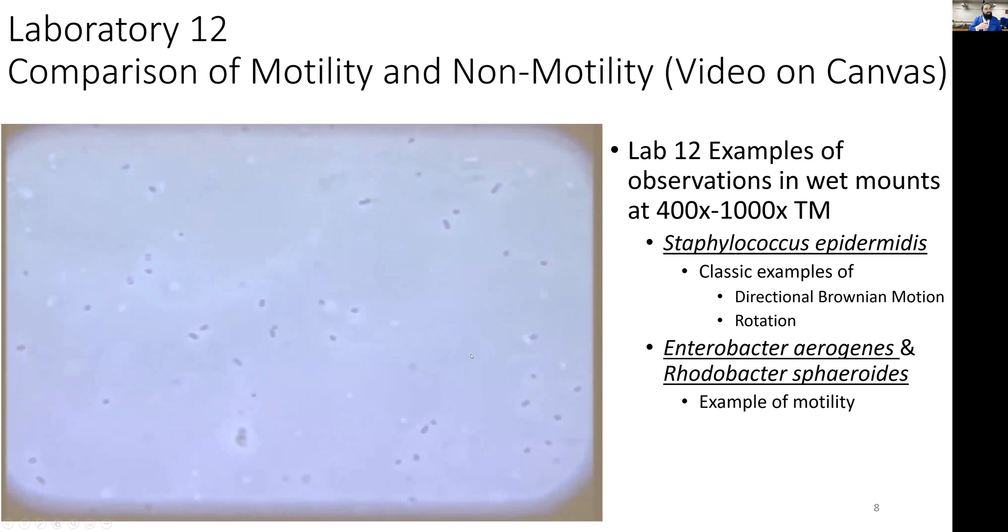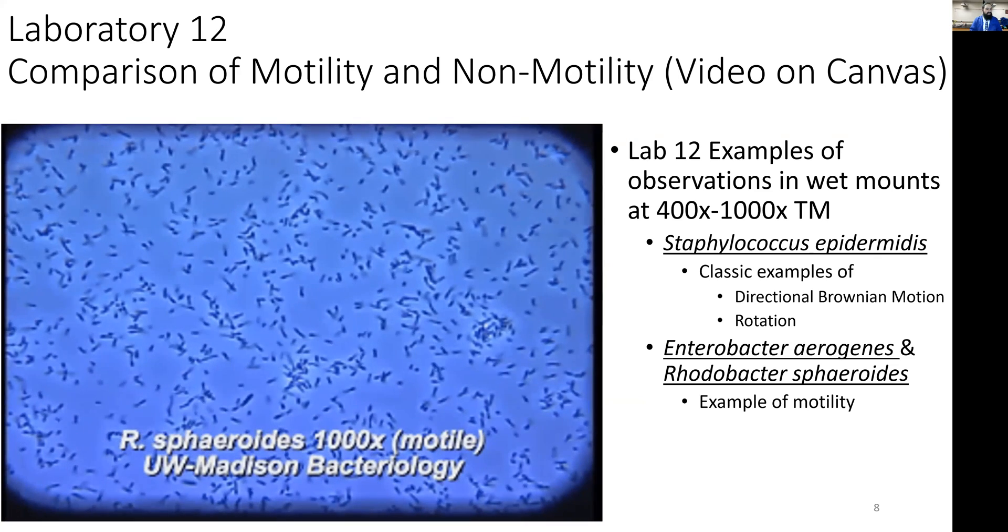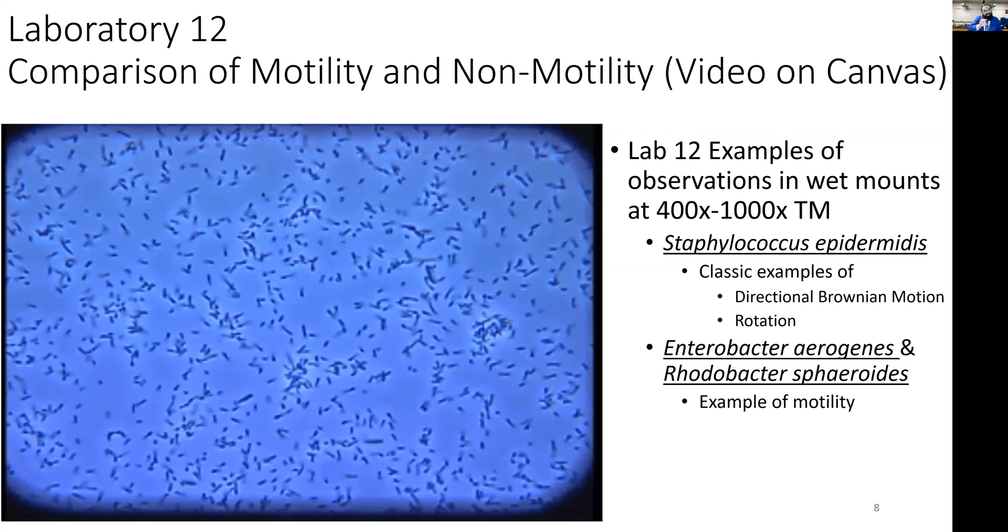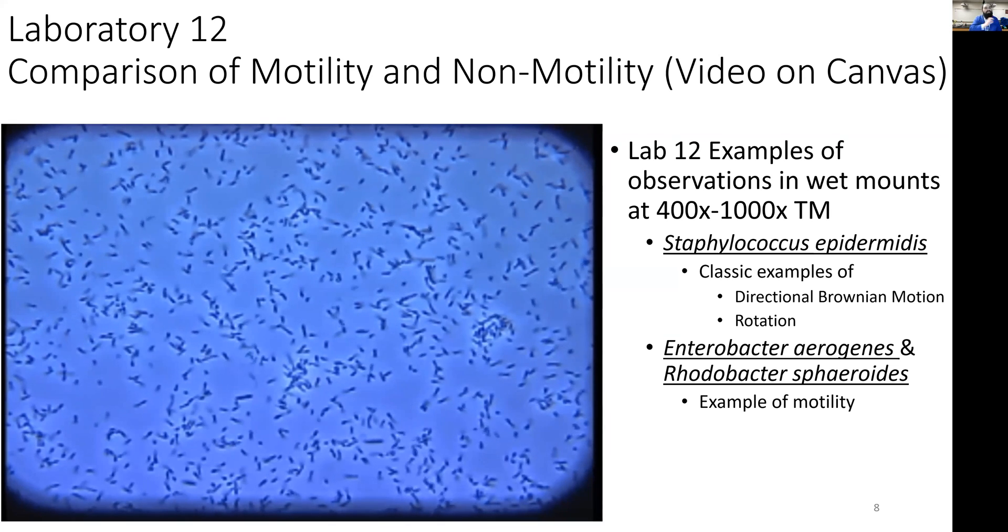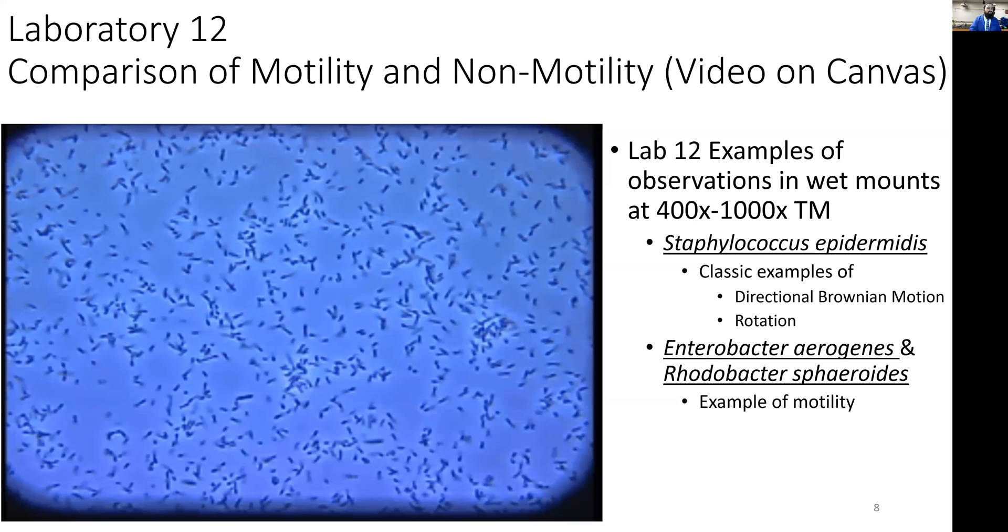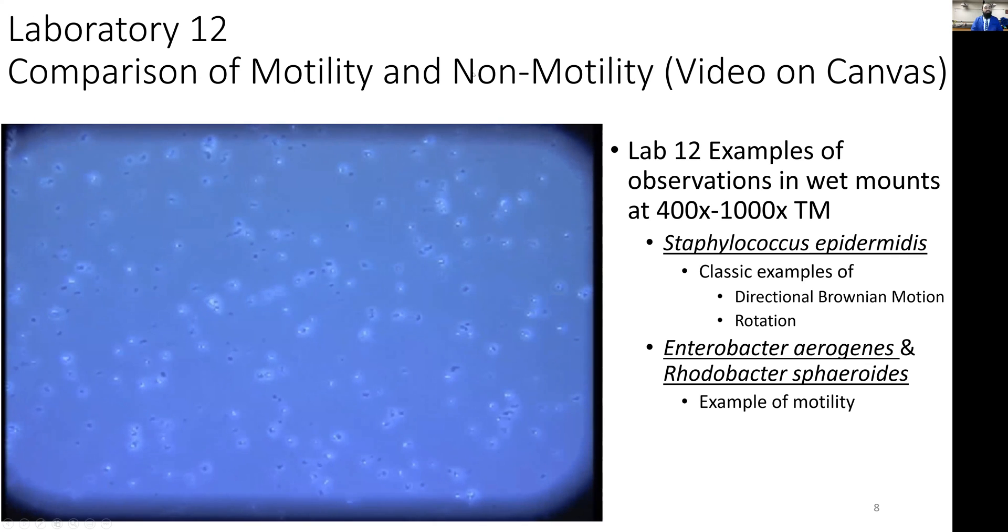Here's one more organism demonstrating true motility—Rhodobacter spheroides. Again, you see a little Brownian motion back and forth, but you can see individual cells moving around. Notice most organisms are relatively stable, but then you see individual cells truly, purposefully moving from point A to point B, spinning in place sometimes or changing directions and moving around everywhere. That's what we're trying to achieve under lab 12.